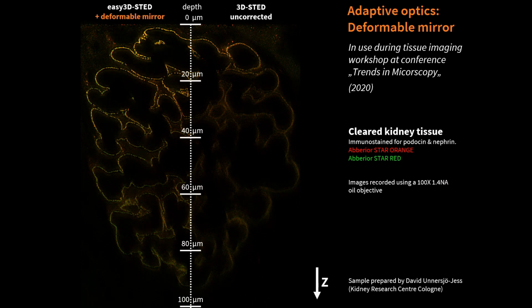What's interesting is that we're here looking at a 3D STED image, which you would expect to decay in a sample if there's a refractive index mismatch. So as I mentioned earlier, 3D STED is very susceptible to refractive index mismatches. But we used the deformable mirror here, and we could maintain image quality very much going deeper into the sample here. And you can see very fine details here in these structures. We're looking here at podocin and nephrin stained by David Unnersjö. Thank you to David for this nice sample.